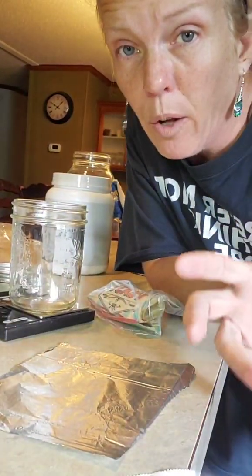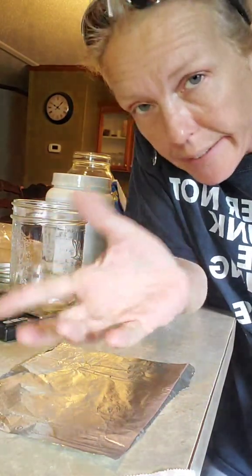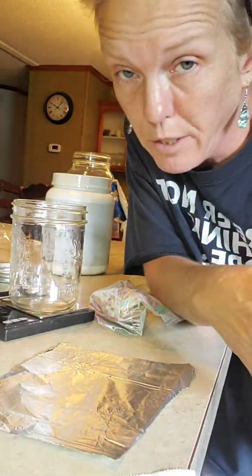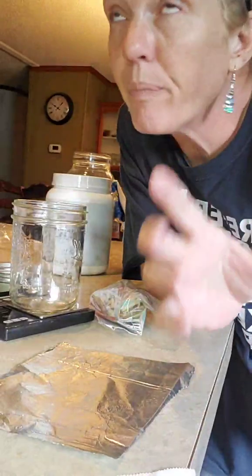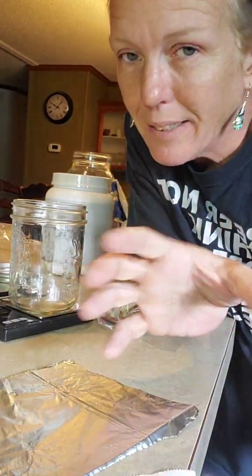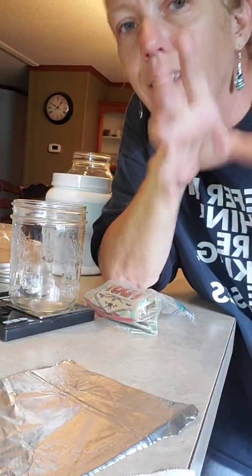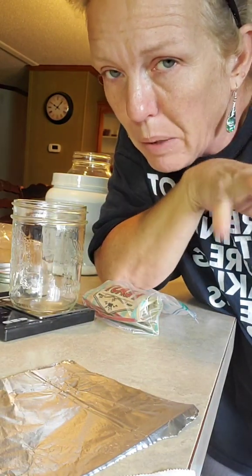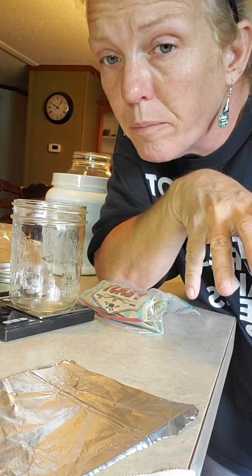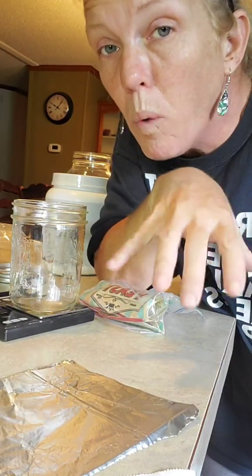People ask me all the time, how the hell do you get your plates to look like they do? Secrets. And I guess I'll tell you. So, when I do malt extracts, I do what they call MEYA, which is malt extract yeast agar. I need a drink. Malt extract yeast agar. And I have a little trick. And believe me, this has come from years of experience. I do add a bump of dextrose to my MEYA.